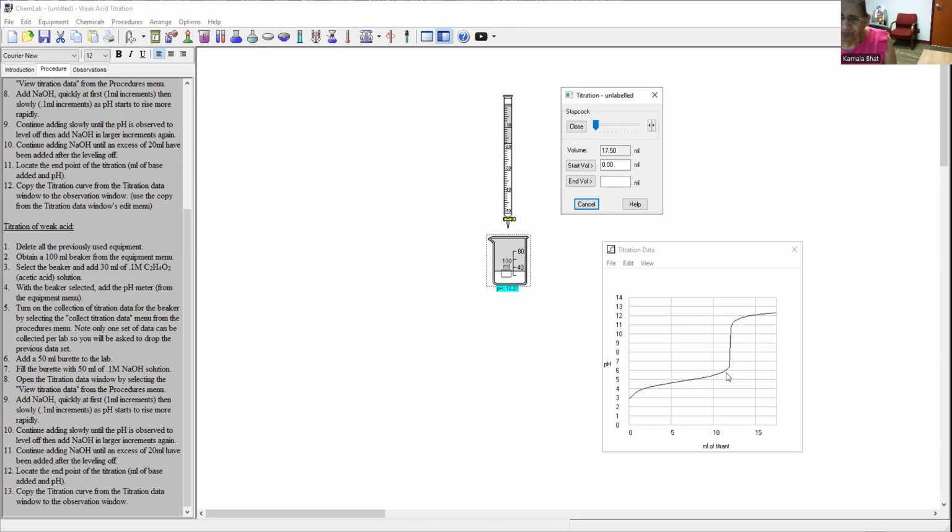And from this, it is possible to calculate the pH at any given time for the reaction. Now, once you get the pH volume, then go to the half volume. Whatever the volume is, go to the half volume and hit the curve at the point where the half volume is, and then extrapolate it to the pH axis, and then determine the pH of the solution.